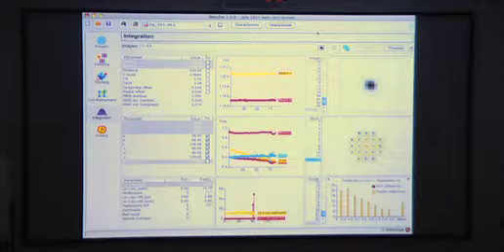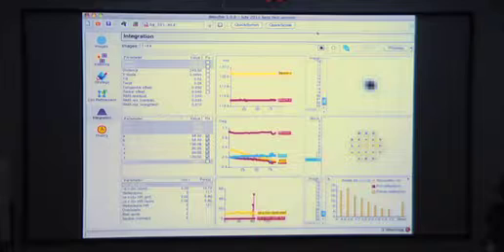This is kind of our favourite test data set. Basically, the graphs that are plotted by default are nice and smooth, but there's something odd happening around image 75 there. And it's the sort of thing that if everything else has gone really well and suddenly there's something not looking quite right, it's worthwhile having a look at the images around there to see what's caused that.